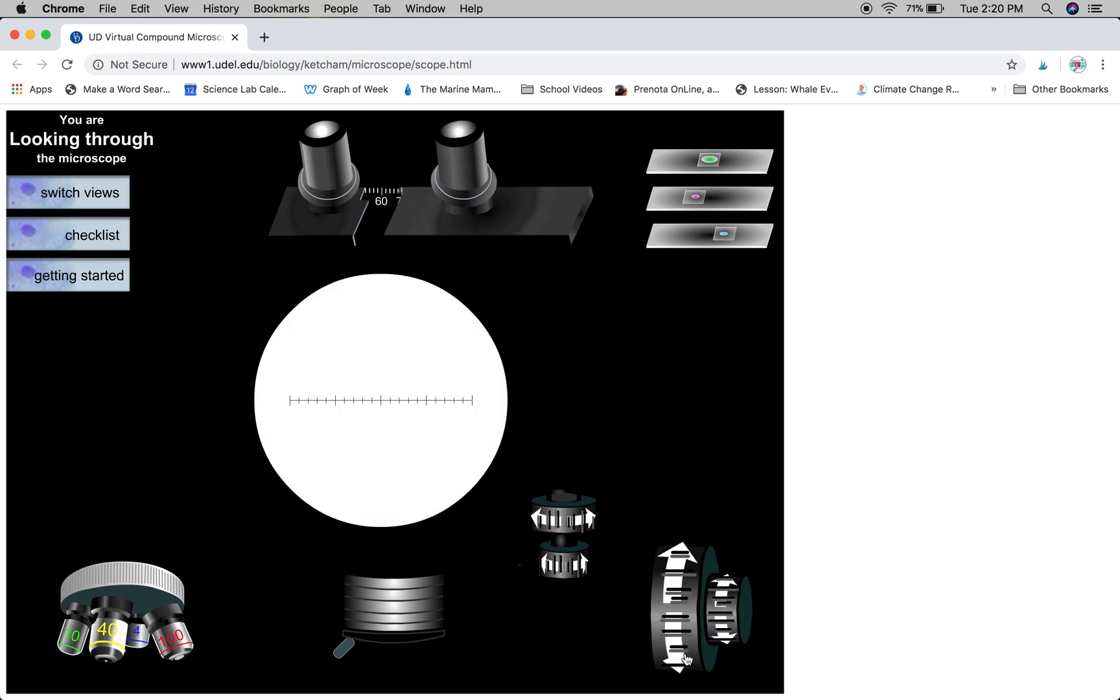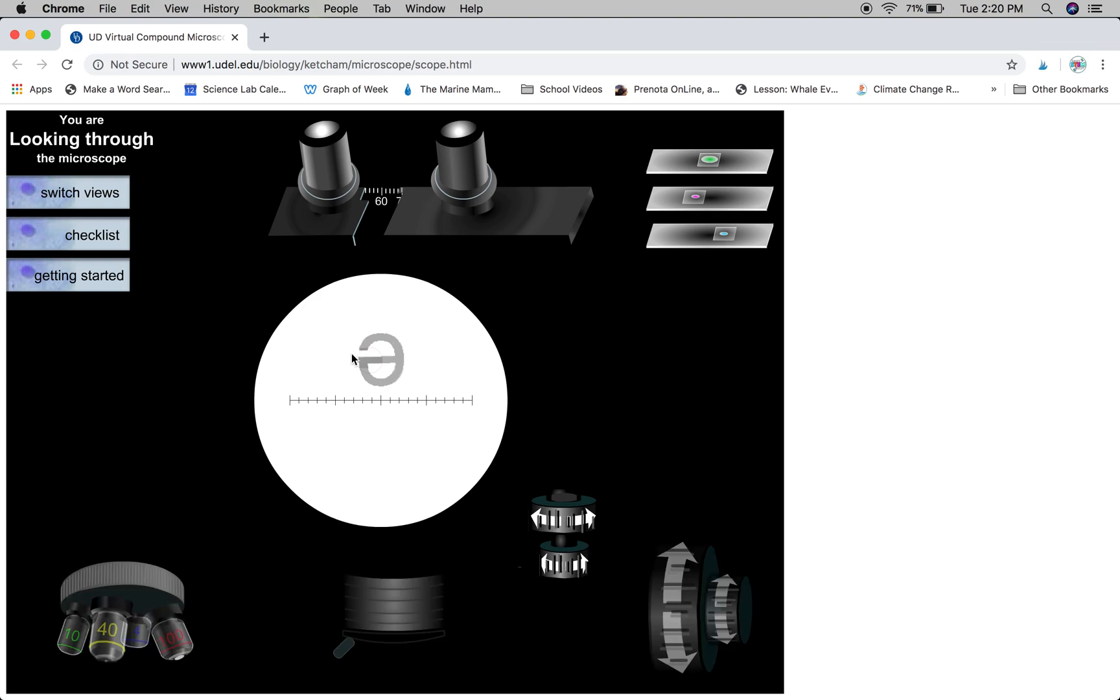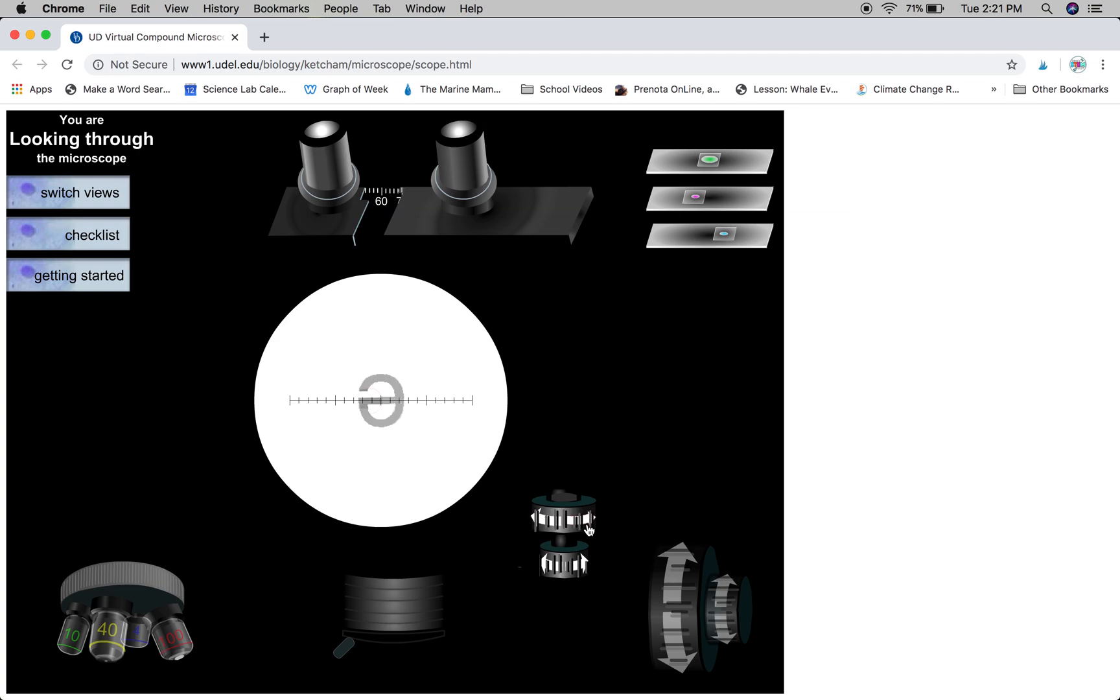Once that's in place, we're going to adjust our coarse focus knob until we see the image. We'll notice that it's not exactly centered, so we're going to adjust that so it's right in the center of our field of view.